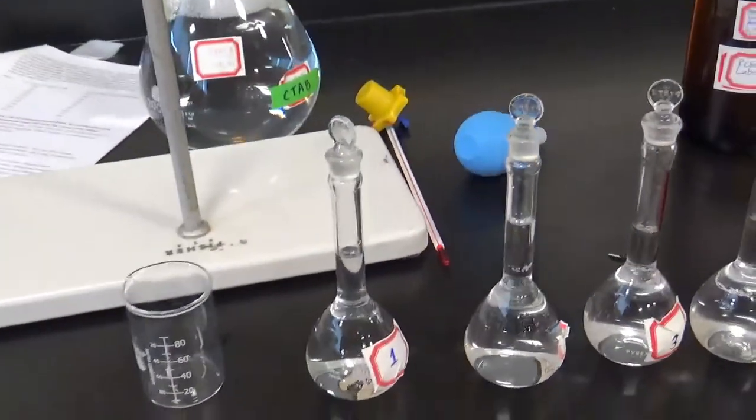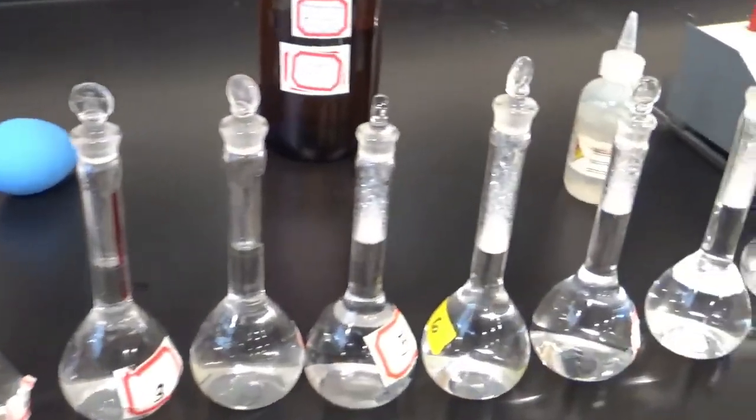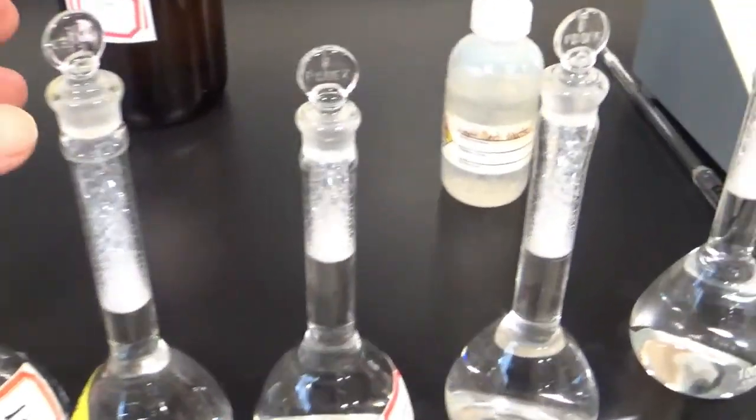Okay, so now you could see that I have made my solutions, all 9 of them, and they had varying degrees of foaminess in them at the end. And like I said, I tried my best to get that meniscus. Well, it's not really a meniscus, but to get the dividing line between where the bubbles start and the solution ends to be just about on that line.